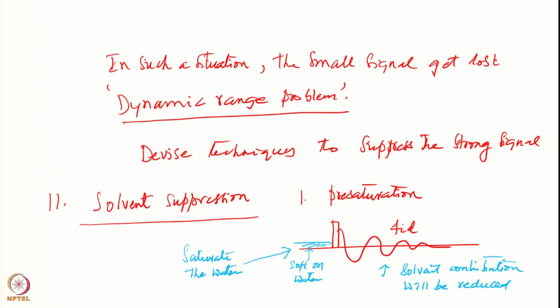And there are other methods. We will see what is called the inversion recovery. We will see the next experiment, which is called the inversion recovery. Let me call this A. Okay. Then I will say B. B is inversion recovery. Inversion recovery technique.